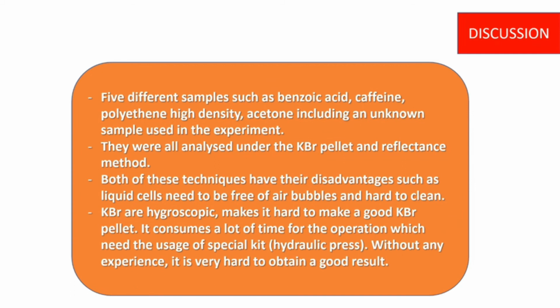They were all analyzed using the KBr pellet and reflectance methods. Both of these techniques have their disadvantages. The reflectance method uses liquid cells. The liquid cells need to be free of air bubbles, so we need to get rid of air bubbles in the liquid cells. The liquid cells are also very hard to clean.